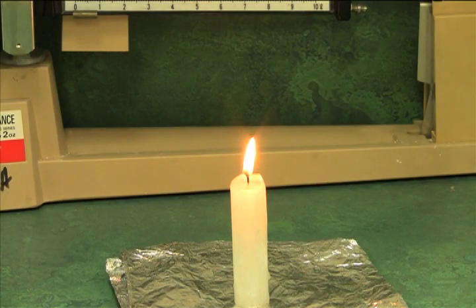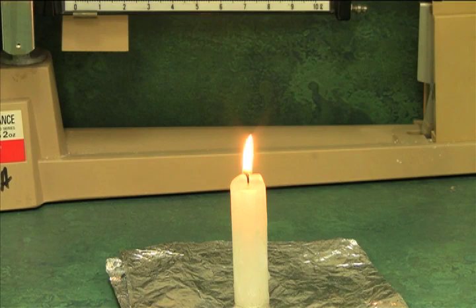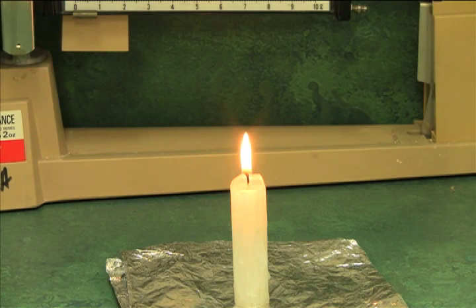Step five says, obtain a jar, place the jar over the candle, and record what you see. Observe carefully the candle wick, the jar, and the flame. And repeat if necessary. So you'll write down those three observations.